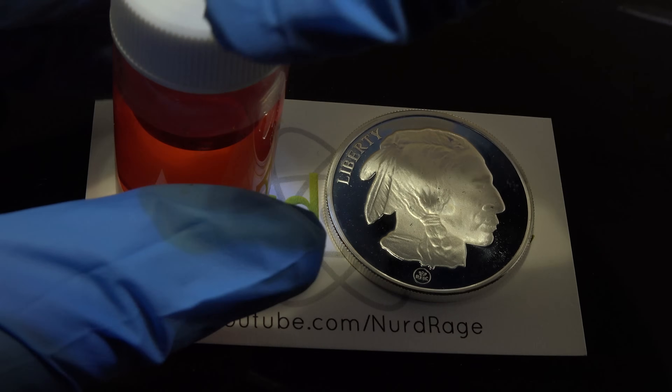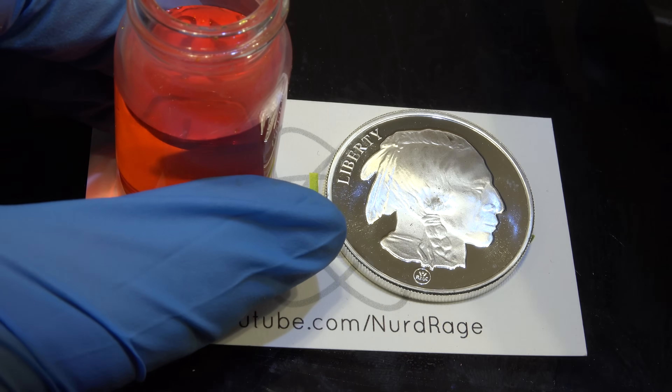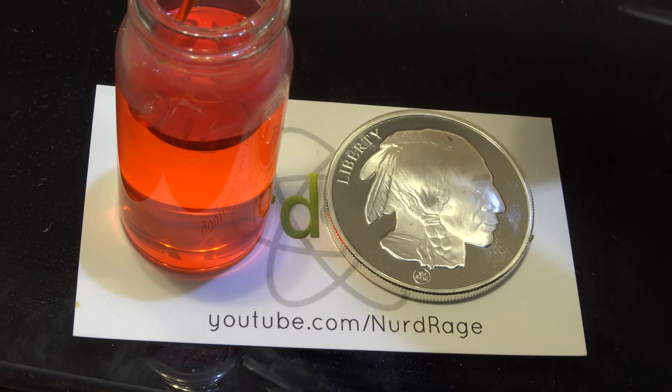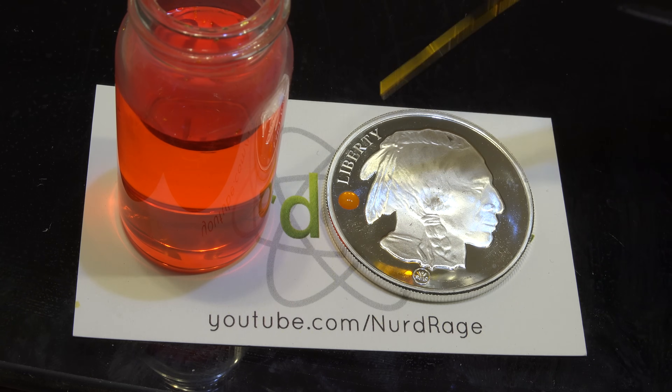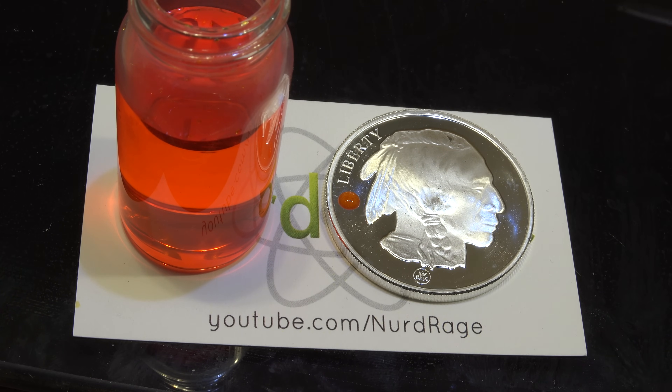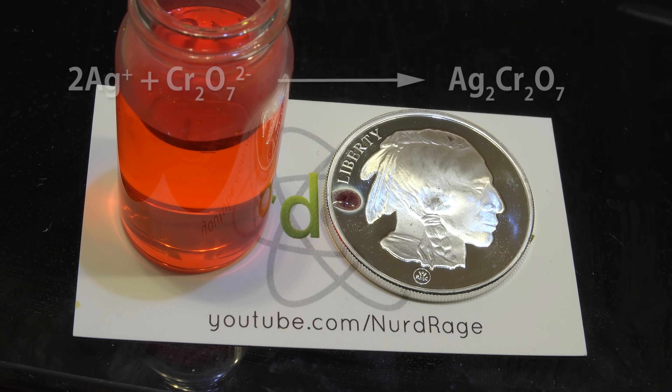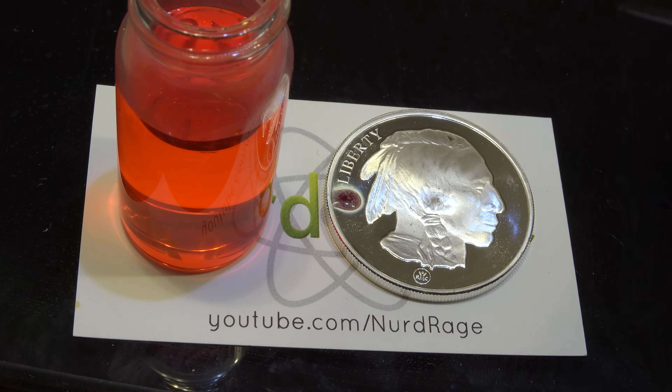So let's give it a try. This here is an authentic piece of silver — at least I'm pretty sure it is. To test it, all we do is apply a drop of the testing solution to the surface. The reaction takes a minute or two so you have to be patient. If this is authentic silver, the nitric acid in the solution dissolves a small amount of silver to form silver nitrate. This silver nitrate reacts with dichromate ions to form insoluble red silver dichromate particles. This is a very strong indication we have authentic silver.